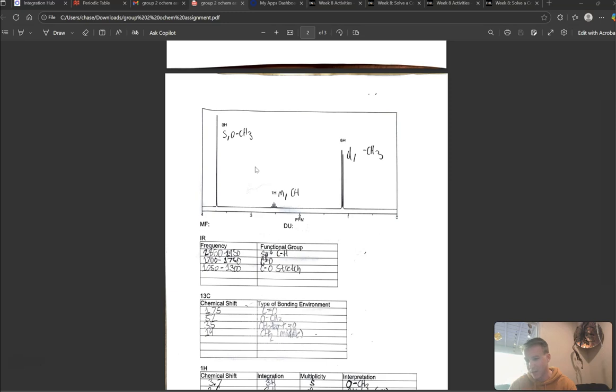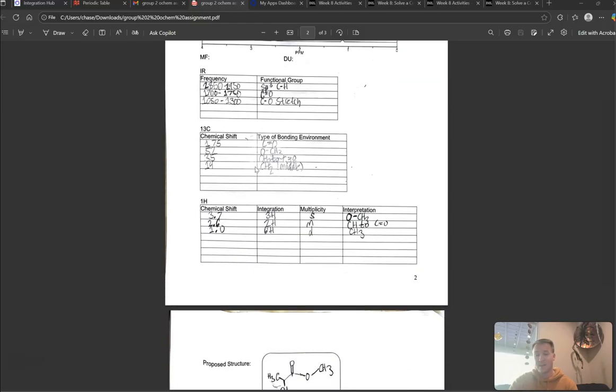It's a CH attached to that C double bond O. And then around 1, we do have an integration of 6H, a multiplicity of a doublet, and we do have 2 CH3s on the same CH. So overall, that's a 3 to 1 to 6 integration, which sums to 10 protons, matching the C5H10O2 that we were shown earlier, and we're supposed to identify its structure.